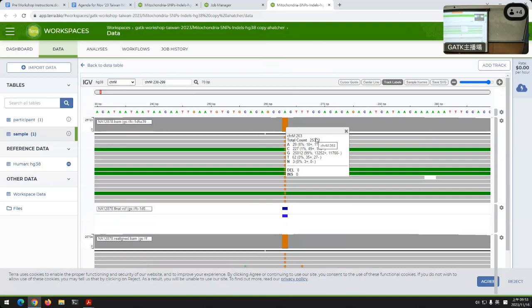Like I said, you get a lot of data. Now, the good thing is you can get pretty solid information on some of these real signals, like from subclonal populations, because we have so much data in there, you can get good evidence for them. It's just handling all that data that's the issue, okay? But my point is, you can use IGV to view this just like you would anything else.